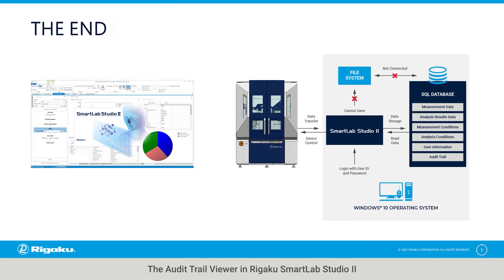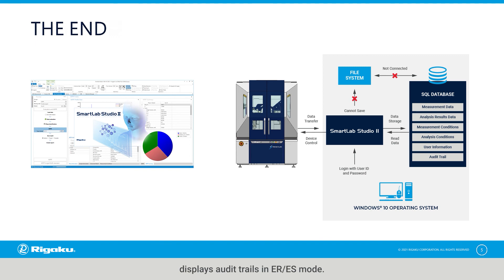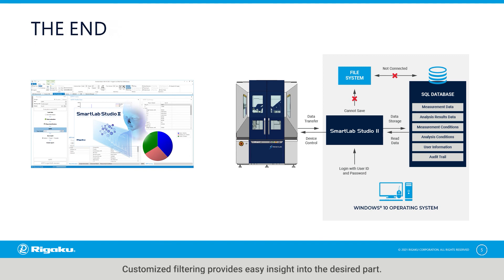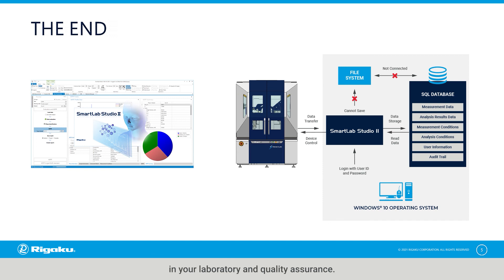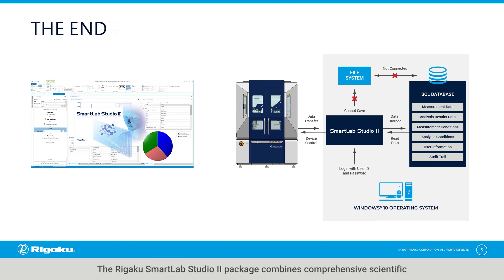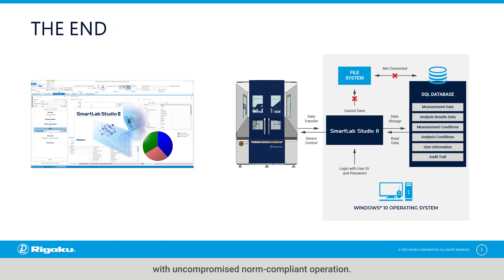The audit trail viewer in RIGACU SmartLab Studio 2 displays audit trails in the ERES mode. Customized filtering provides easy insight into the desired part. Electronic records and signature ERES for maximum data integrity in your laboratory and quality assurance. The RIGACU SmartLab Studio 2 package combines comprehensive scientific and easy-to-use X-ray diffraction analysis with uncompromised norm-compliant operation.